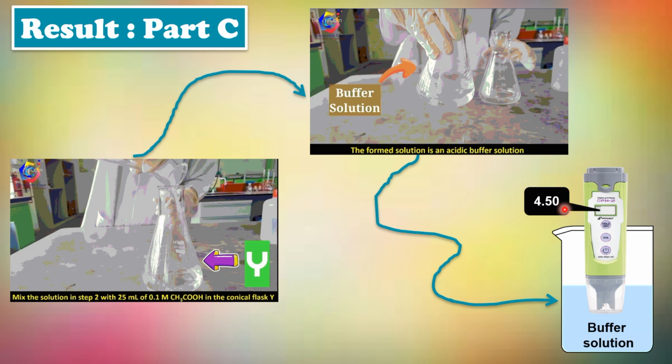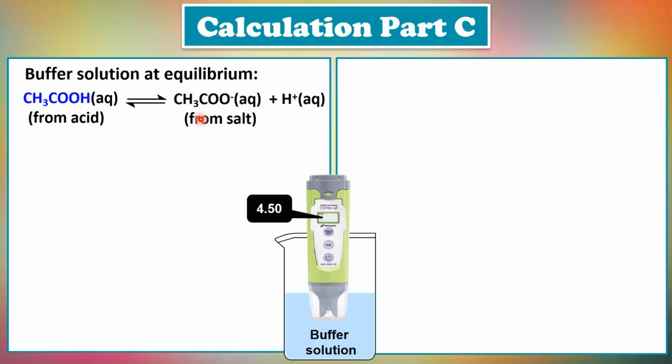The pH here is 4.5. So for the calculation in part C, we already know the buffer solution at equilibrium contains weak acid and also conjugate base that came from the salt.